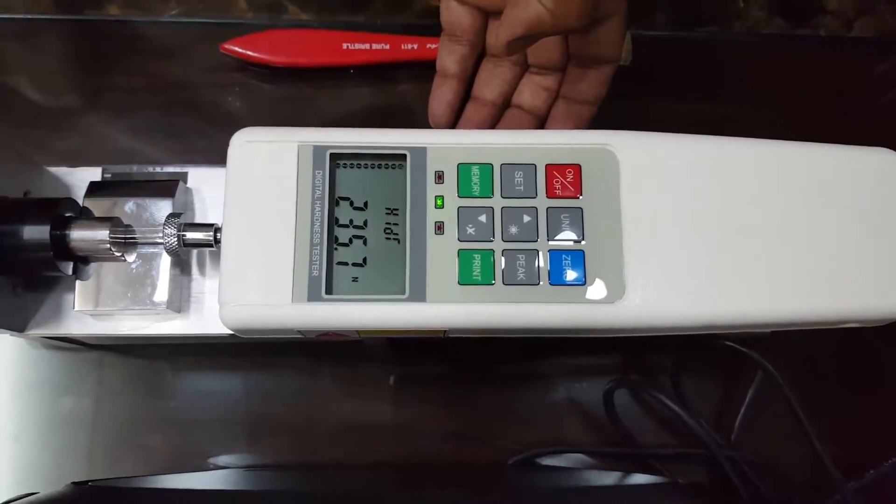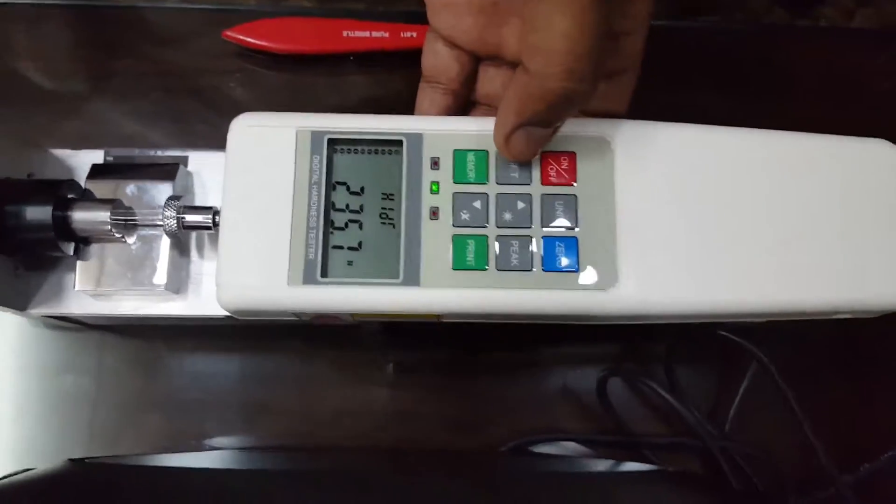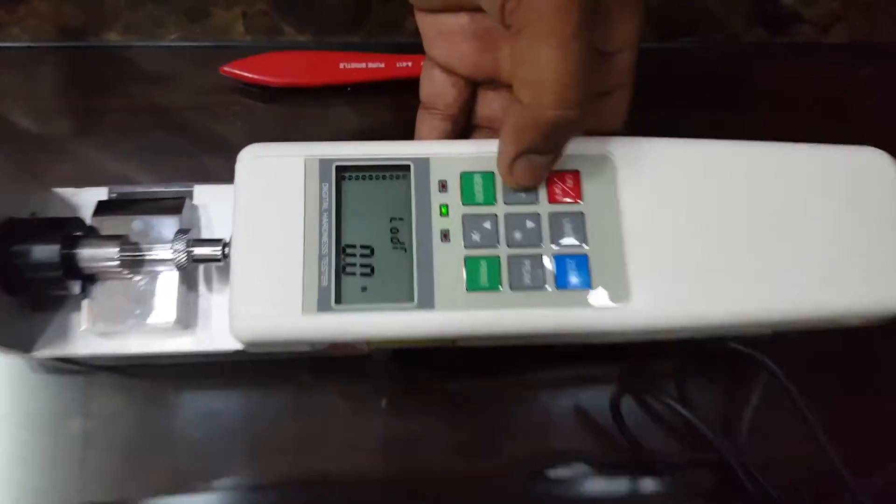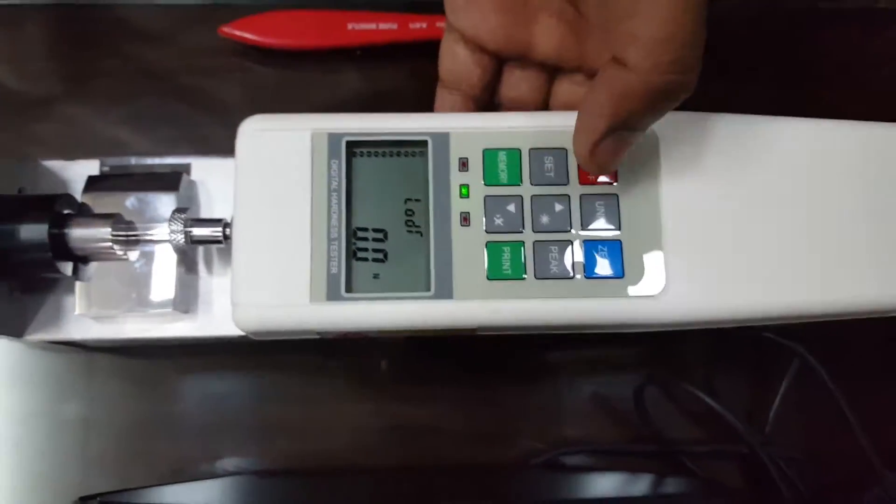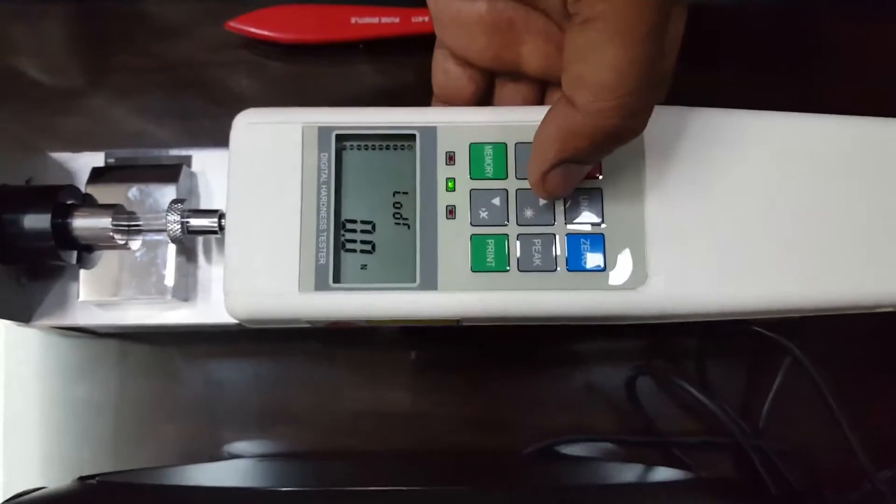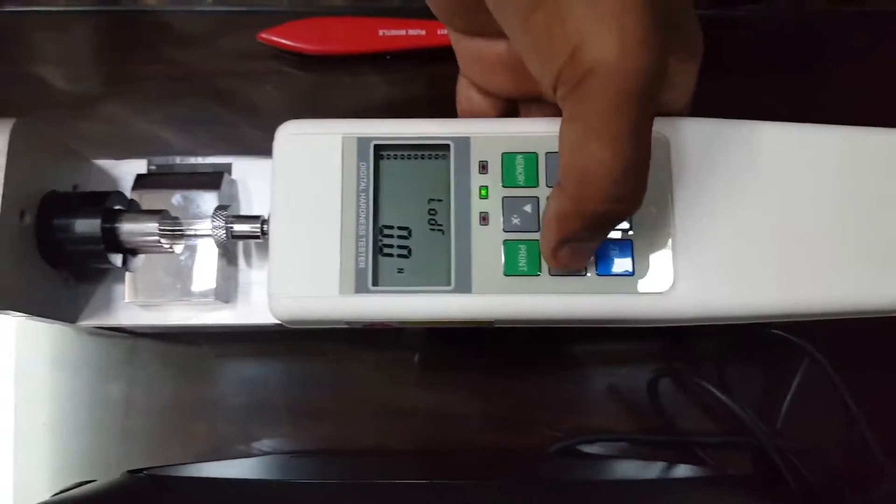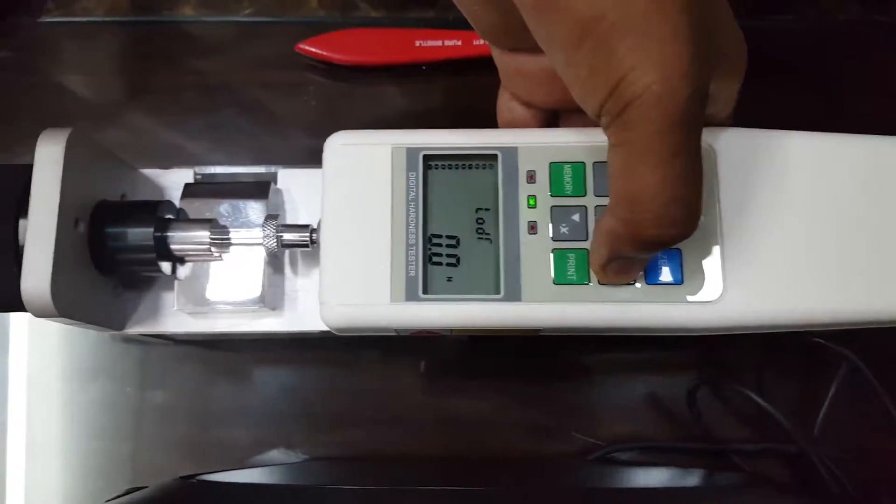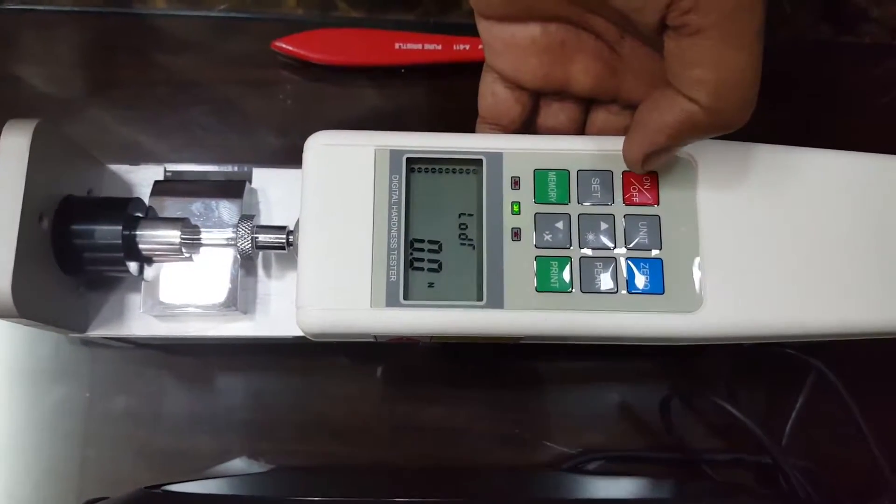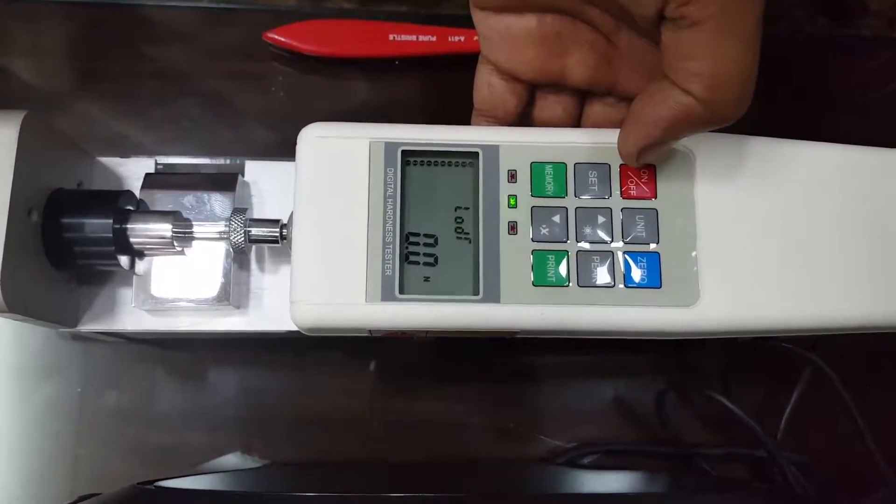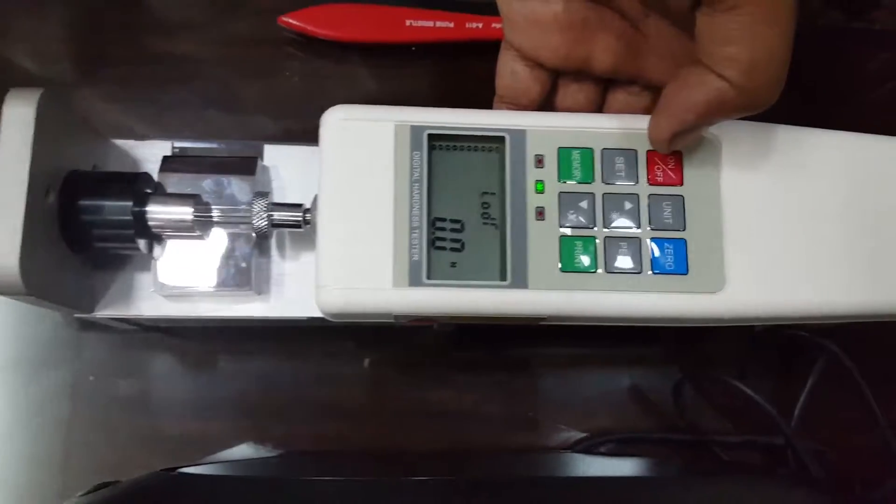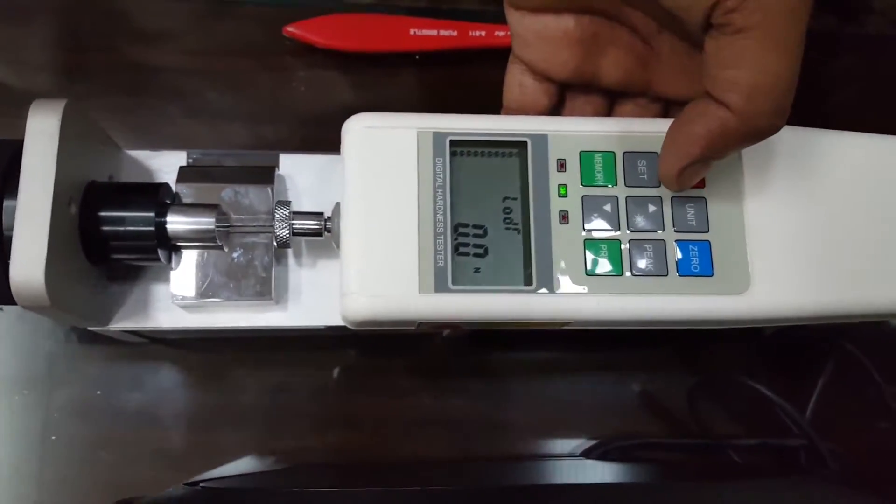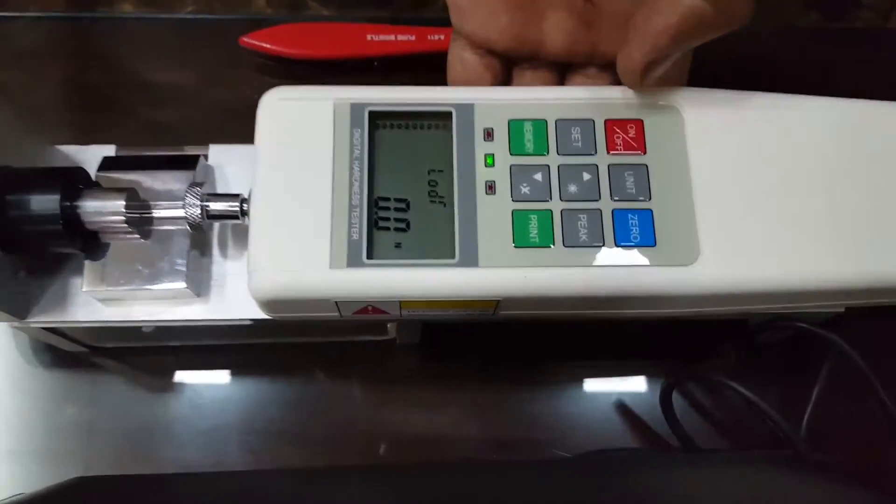The Peak button is to hold the maximum hardness which is reached when we break the tablet. That maximum hardness will be automatically frozen on the display.